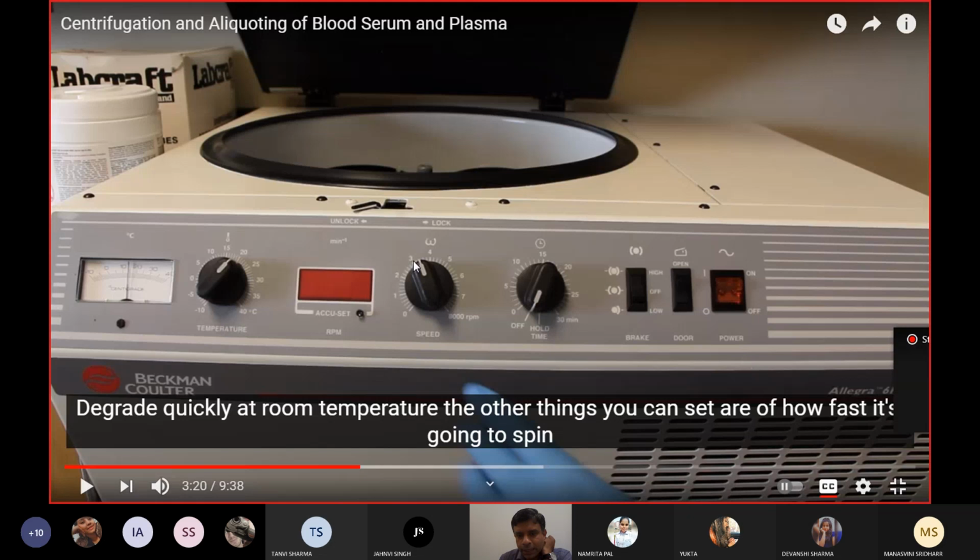And in research laboratories you will usually see centrifuges which can also maintain the temperature inside this chamber. For example, if you are looking for a specific protein which degrades very soon at room temperature, in that case we usually use these centrifuges which can also maintain the temperature.